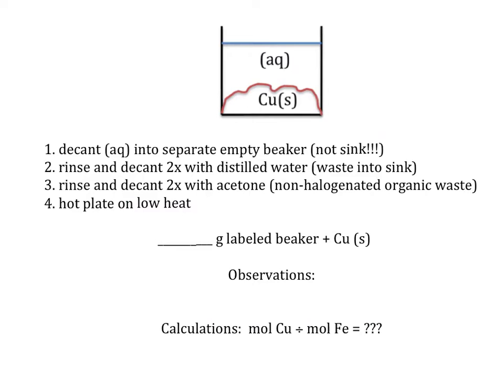So at that point, you'll know it's done, or you can visually see it if you look at the bottom of the beaker. All right, so look from below, you'll see the copper metal. So it used to be dark black, sort of brownish grayish iron powder, has now become reddish brown copper metal. And that'll be at the bottom of the beaker. So our goal is, can we isolate that and get rid of impurities and dry it so we can find its mass? Problem obviously is that there's this solution above it.